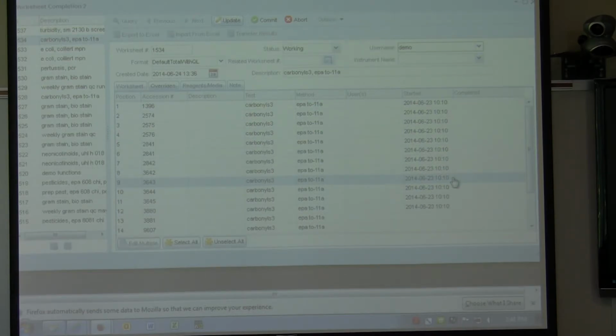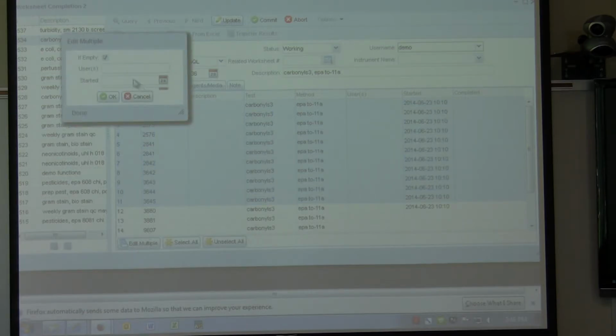In the previous example, you just showed you could pick one of the analytes and it brought the whole group over. I thought this would. This is on the overrides tab. There's only one row per thing on the overrides tab. Yeah, okay, that's why. That's good to know. Let's see. Should we try this? Maybe it's something else. Maybe it's just the tables.